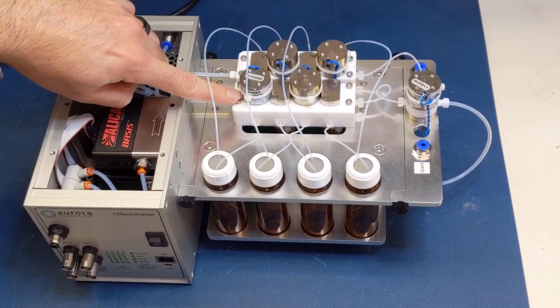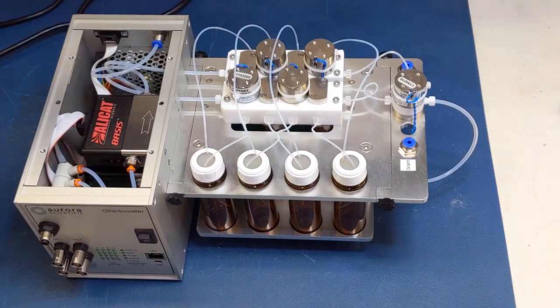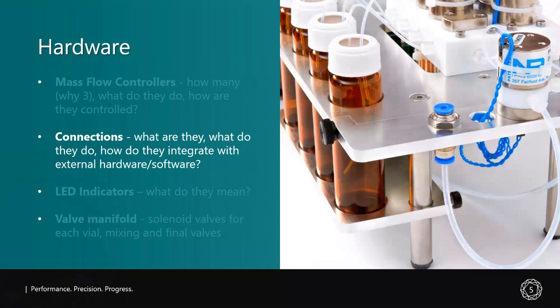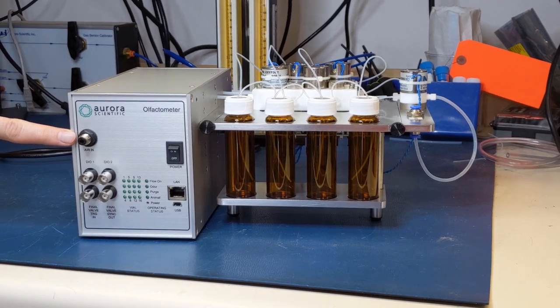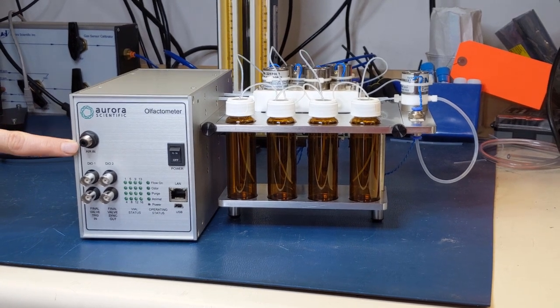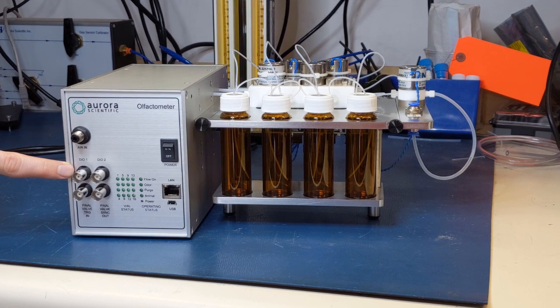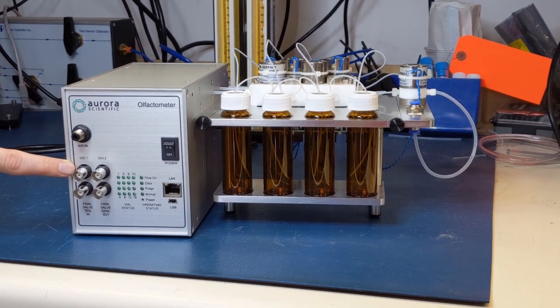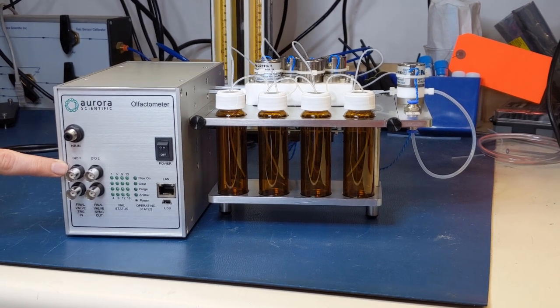The odorant is then mixed with the dilution line at the mixing valve prior to being released at the final valve. Now that we've discussed what's inside the box, let's focus on all those front and back panel connections and how you can utilize them to their full potential. Looking at the front panel, you'll see the air-end push fitting to connect your clean air source. Below that are your BNC connections, first of which is DIO1, an input that takes an external TTL signal to trigger the start of a sequence written in the 220A control software.